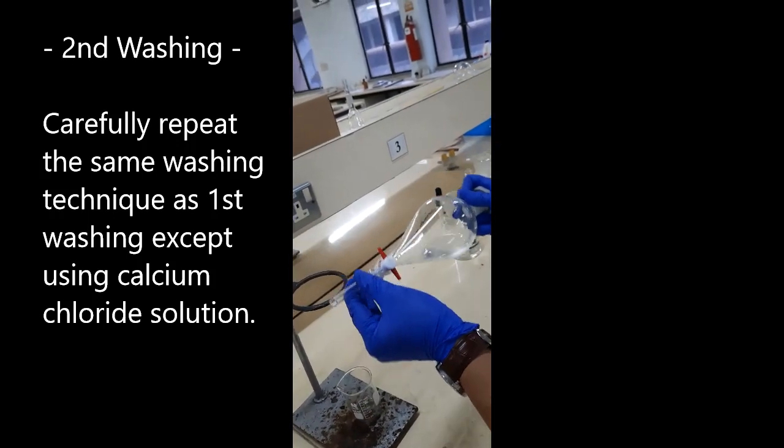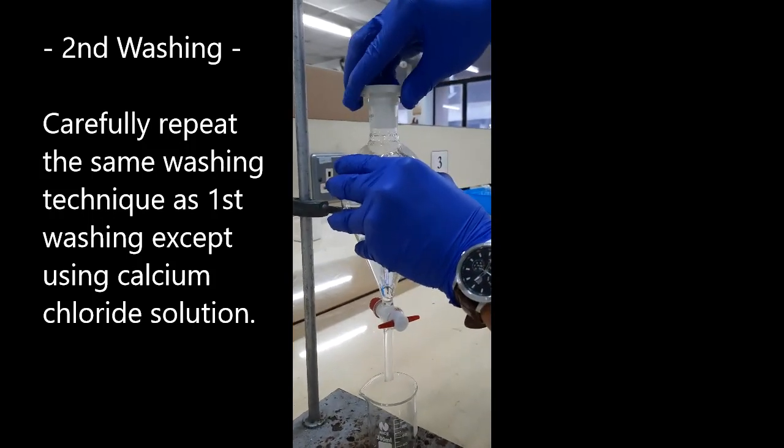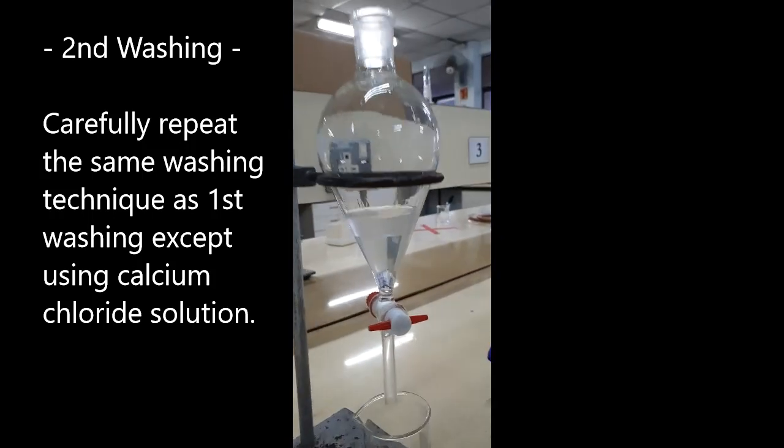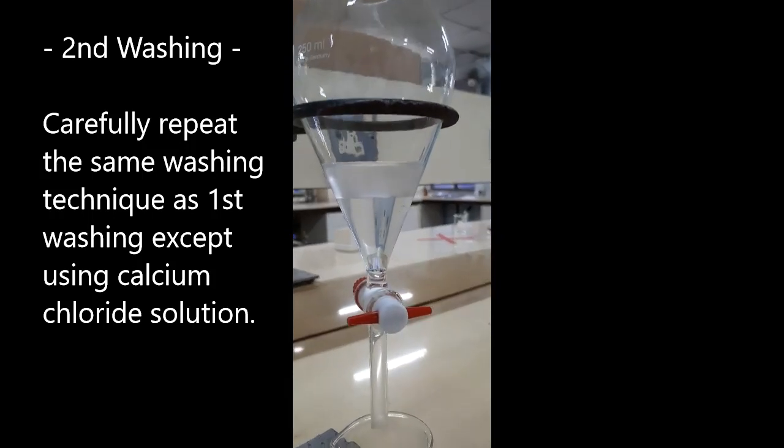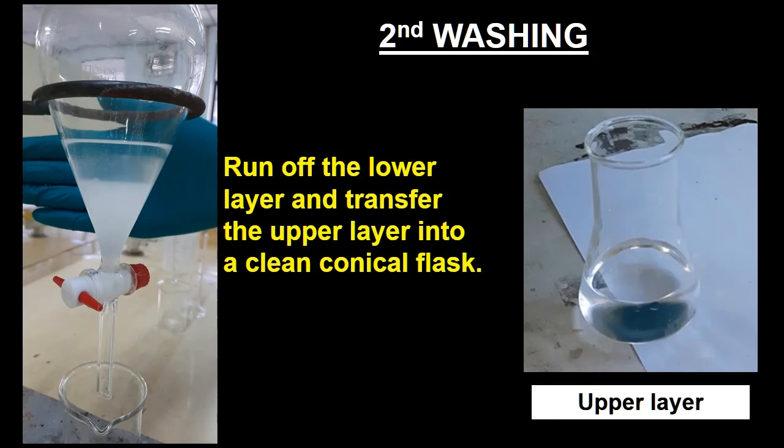Leave the separating funnel to stand for a while before opening the cap. Observe the liquid layers before and after shaking the separating funnel. Run off the lower aqueous layer. Pour the upper layer into a clean conical flask.